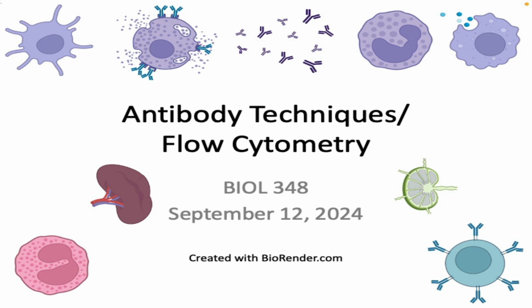The plan for next week is that we're going to do some cytometry once you know how it works. So I need to go through how flow cytometry works. Like I said, the plan for next week is that we will actually prep some samples and do some cytometry, provided that my machine is working by then.